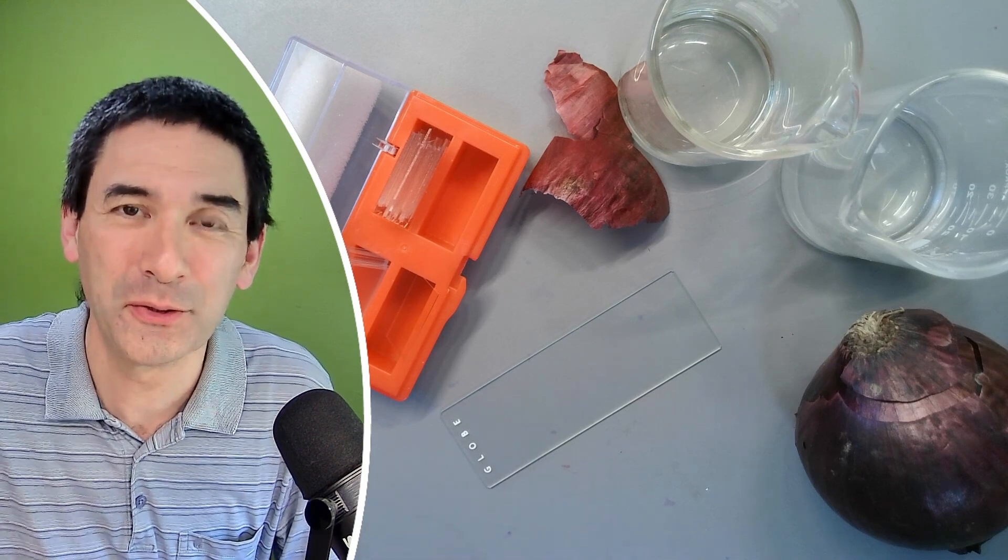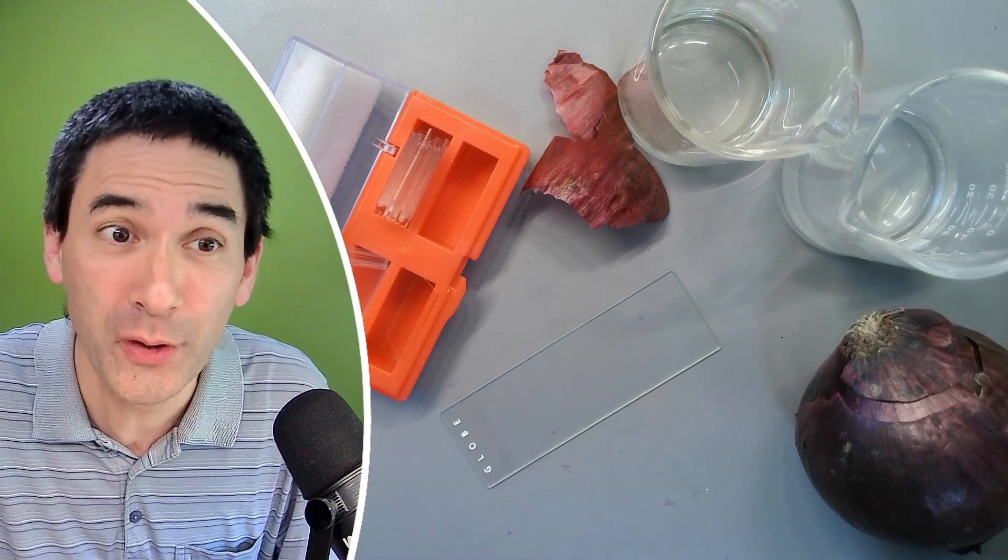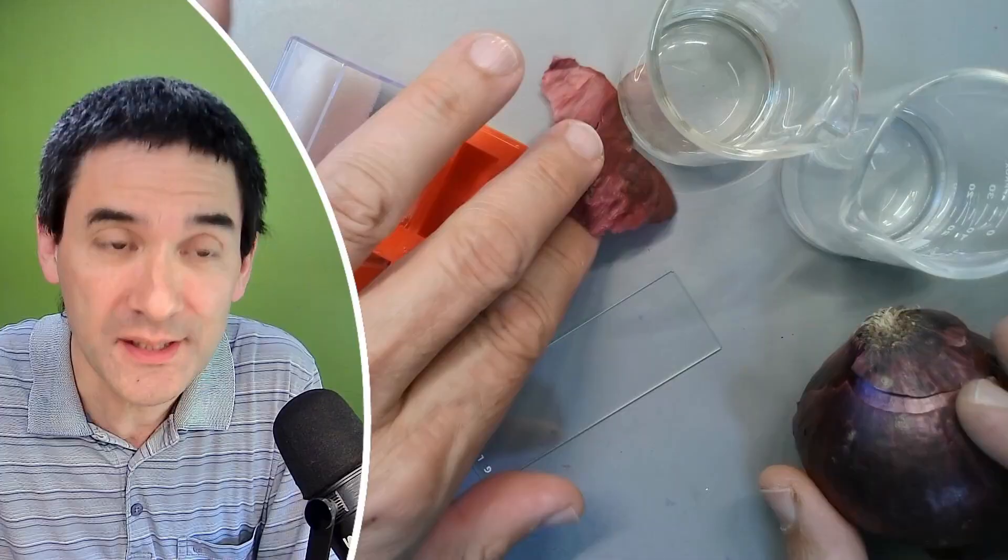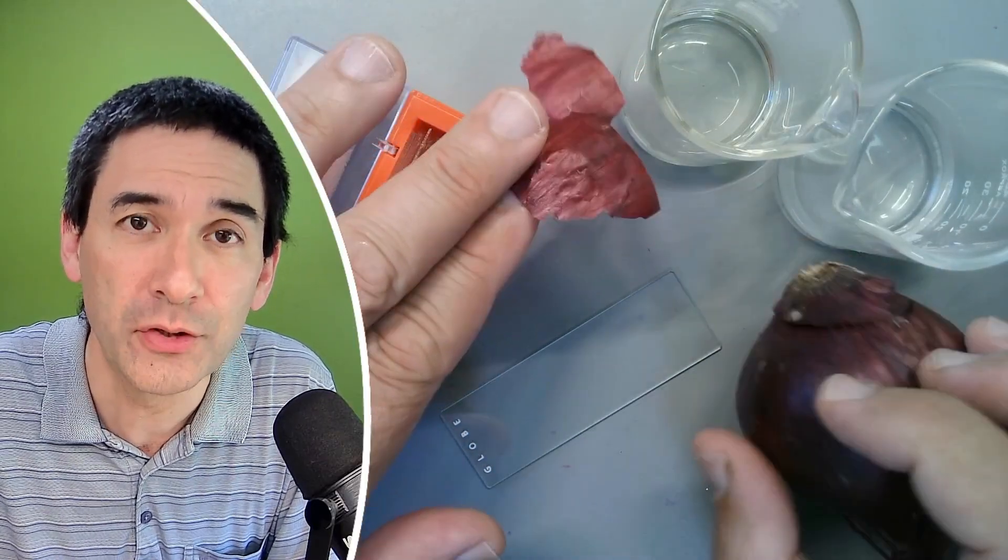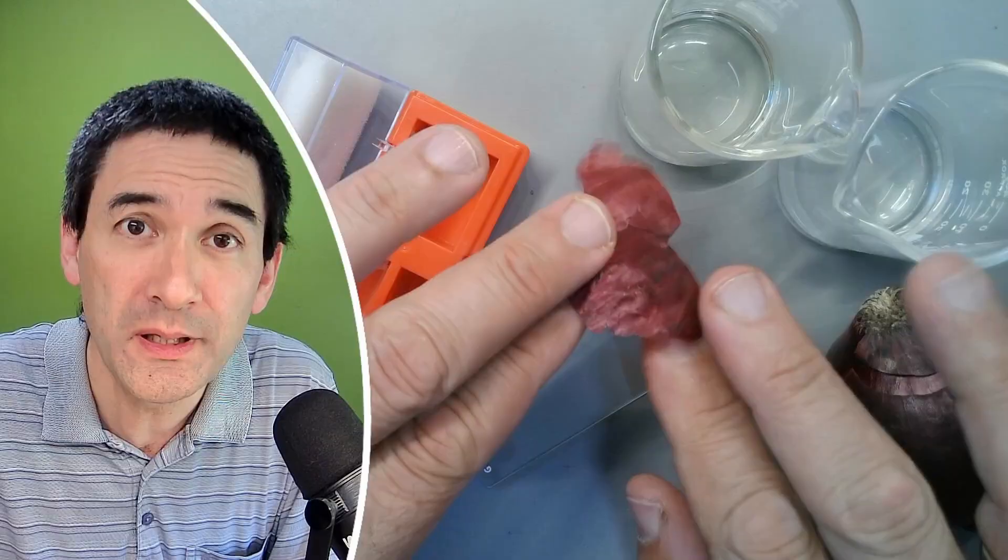So hi, hello and welcome again. Microbe Hunter here. Today I'll be showing you how you can prepare some onion skin, specifically this dry outermost layer here, for microscopy.